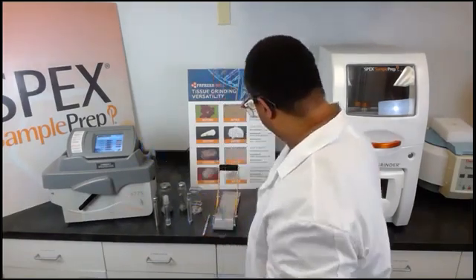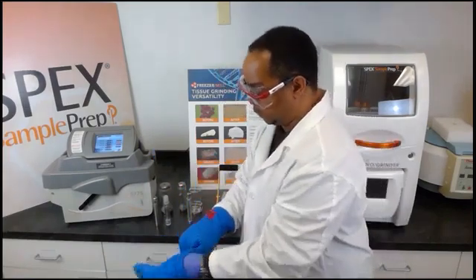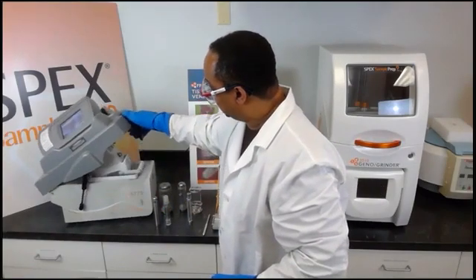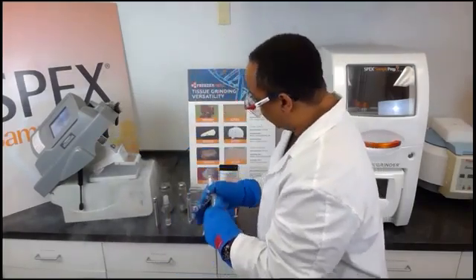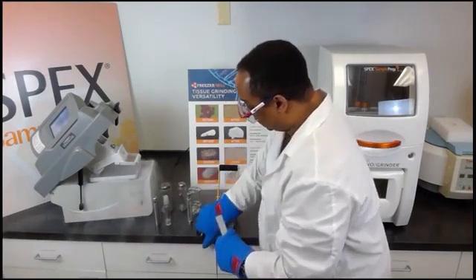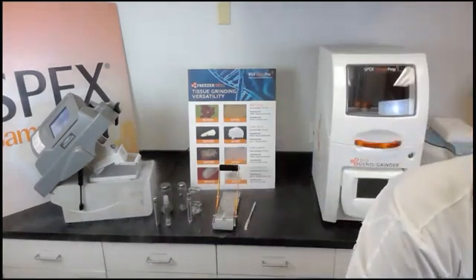So when removing the sample from the freezer mill, we want to place our cryogenic gloves back on. It can be a little difficult. We want to unlatch the lid, raise it up, and remove the sample as such. We place the sample inside the lever extractor. Press it open. Next, we remove the impactor with the magnetic pin. And here I'll show you what the after results look like.